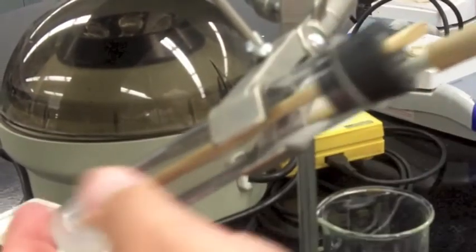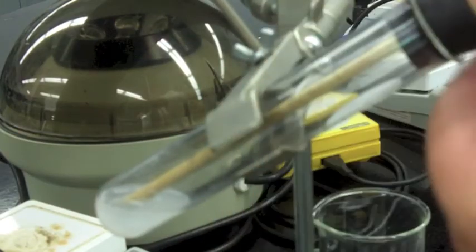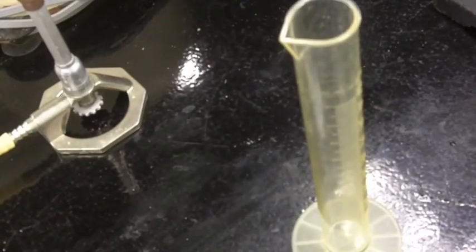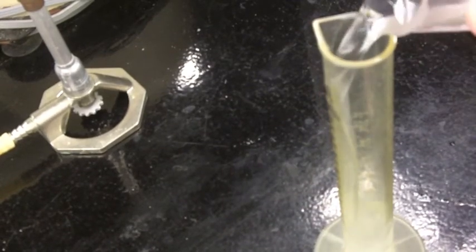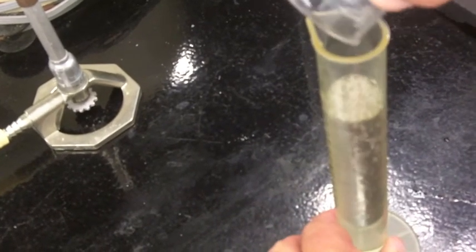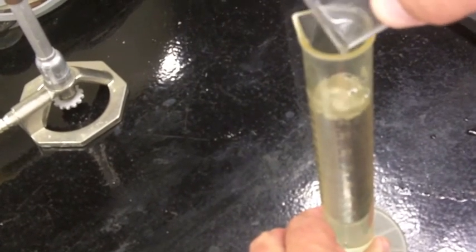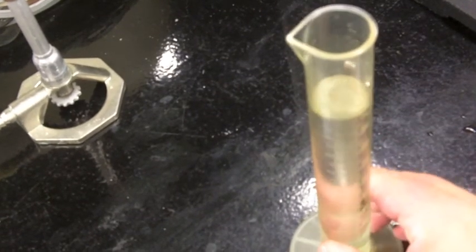When you think it's done, hit on it, make sure there's no foam left in there, pull the tube back out to its original location, and then again do the equilibration of the water levels. So you can now measure the amount of water that was displaced in the graduated cylinder. 100 mL will usually be enough, I think, so that will allow you to get the amount of gas displaced that way. That's part of the gas calculation.